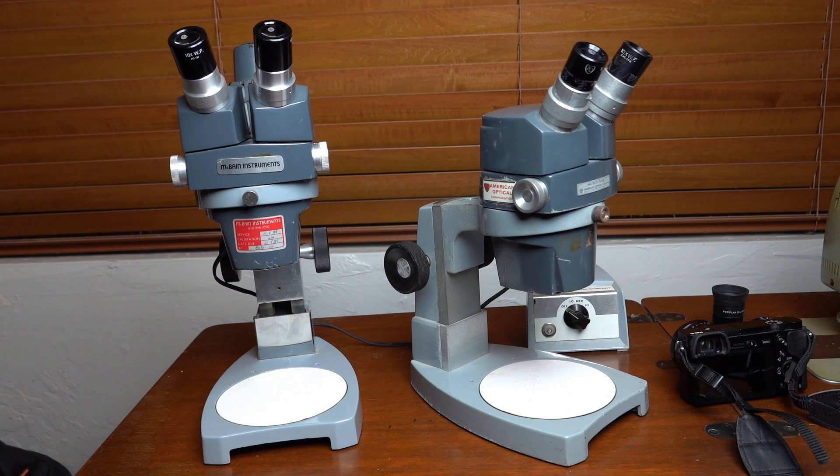This video is about how I get video through a dissecting microscope. Here's a pair of circa 1970s American Optical dissecting microscopes. The one on the right is an American Optical 570, which is 7 power to 42 power. And the one on the left is an American Optical 569, which is 7 power to 30 power.